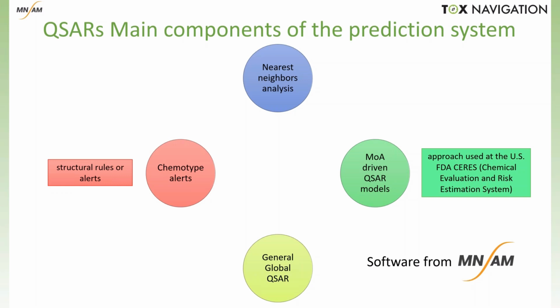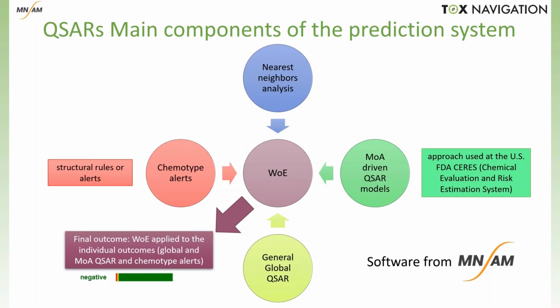The software provides a robust and rigorous method for quantitative weight of evidence based on a combination of all these models using a statistical process, the Dempster-Shafer theory, into a single call of percent chance positive, percent chance negative, and percent uncertain.